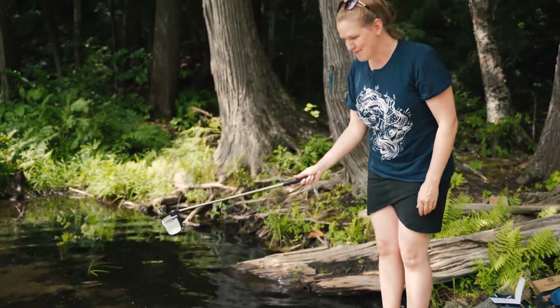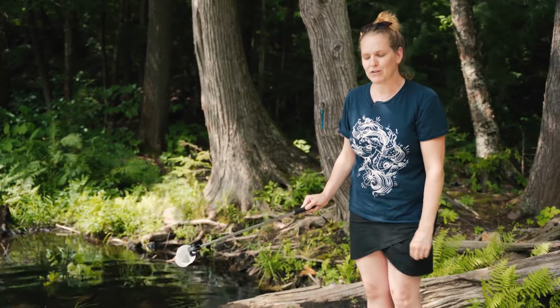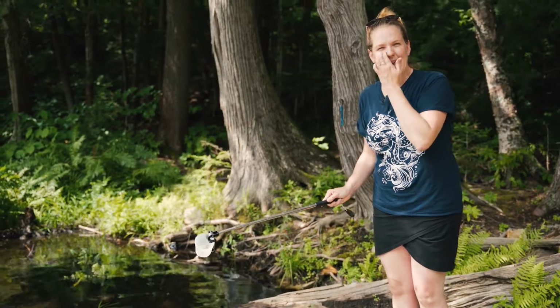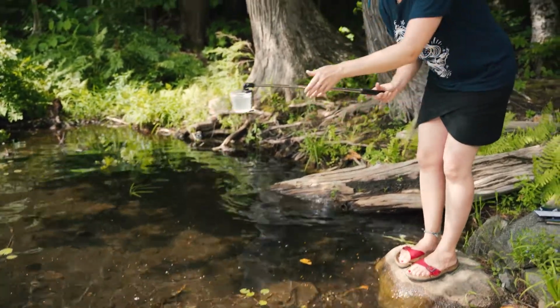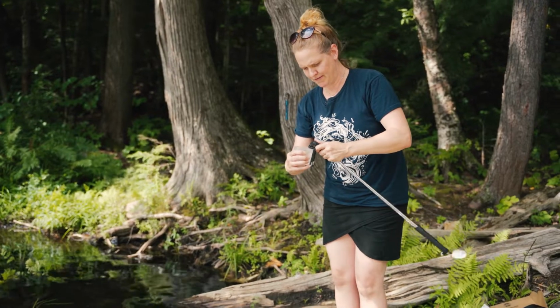I'm ready to take my sample now, and I'm going to try and reach 10 to 15 centimeters below the surface if it's deep enough. Now we always want to reach as deep down as we can, just so that we're not getting the surface water. There we go. And I'm going to take my sample cup off.